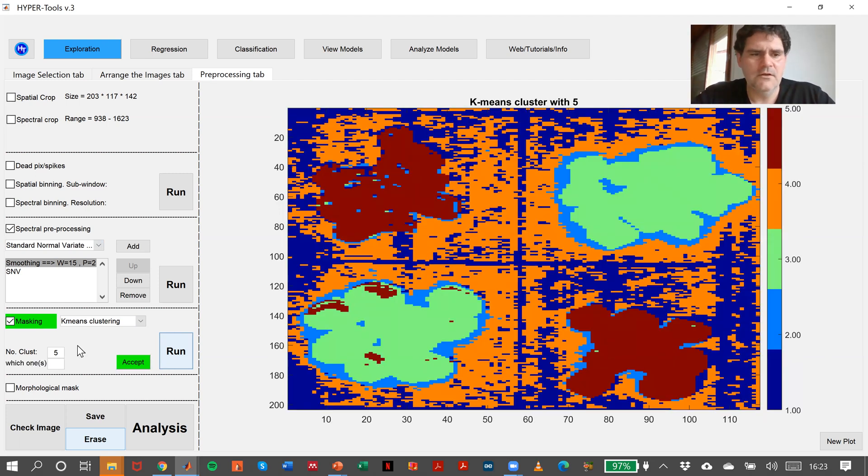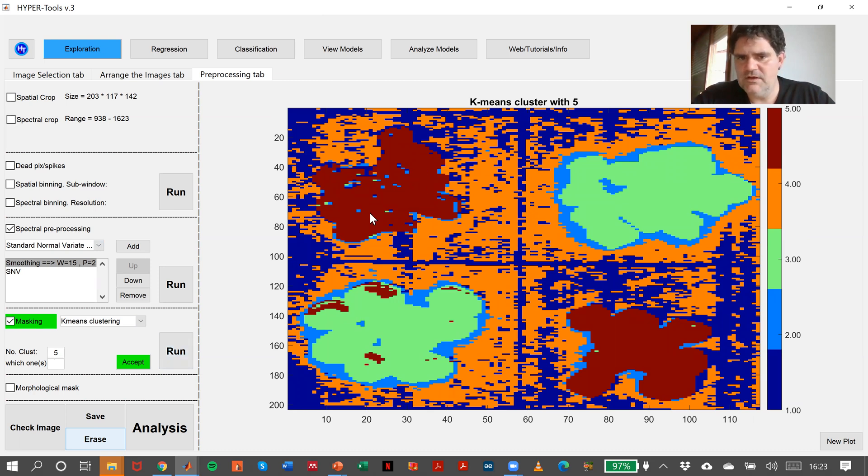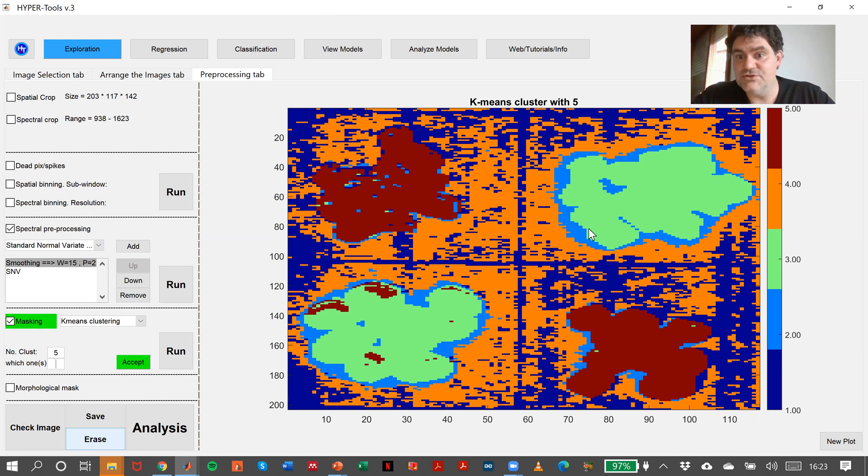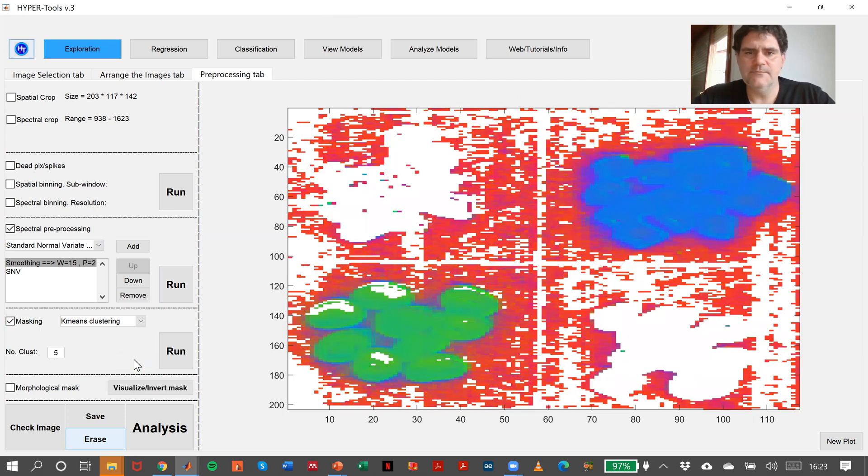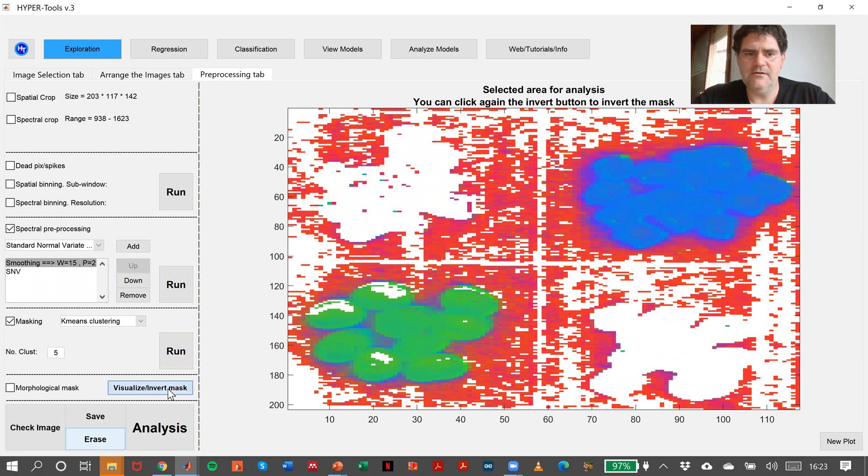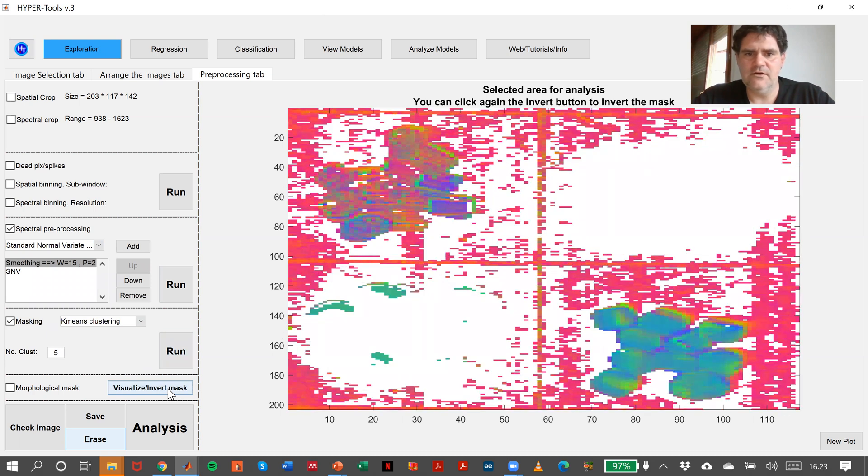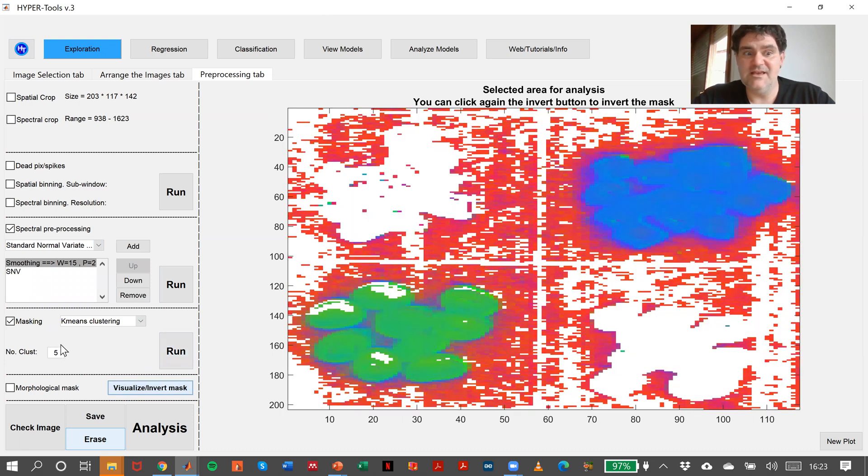In here I can say I am interested in cluster number four and cluster number three, and also cluster number two. So four, three, two, accept. There we are. I made a mistake here selecting the clusters.